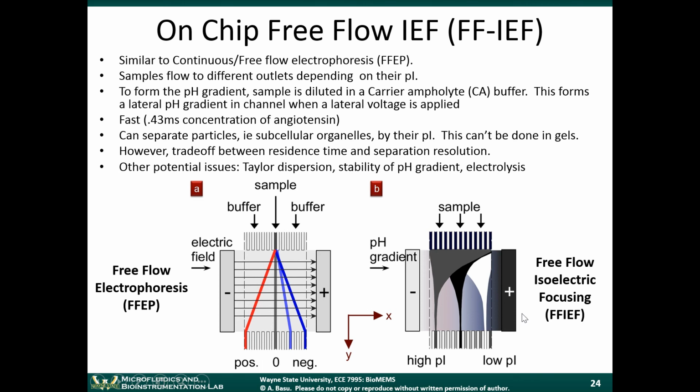So imagine just being able to take a sample, putting it into the chip, and you have all the separated components just coming out at different outlets. That's pretty cool. A lot of microfluidics is focused on separating biological mixtures like this. It was shown that you can separate not only molecules but also particles and subcellular organelles by their isoelectric points.